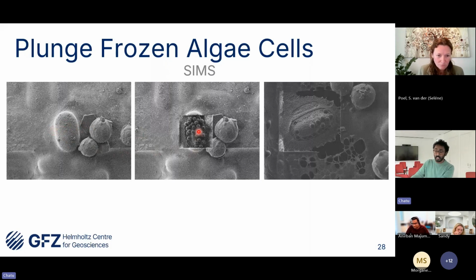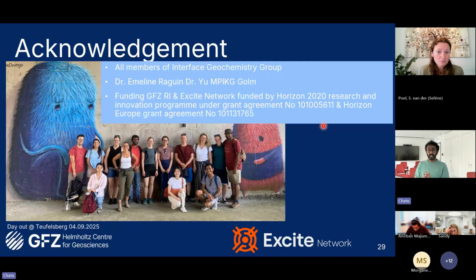And then we started to see these kind of small round particles coming up. And they're really rigorous. Even with the ion beam milling, we could not see them disappearing. So they are really tough. We are currently investigating what these things are. Even after full milling, you can see the bottom of the grid is already consumed, but these particles are still remaining. This is one of the questions we want to understand, what is happening. And we are currently developing in this direction in our work. So this has been quite a bit of work involved.